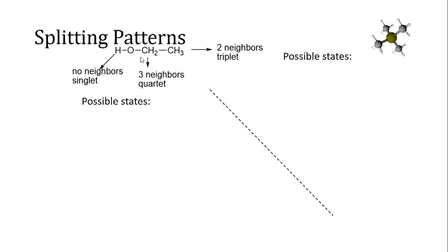Generally, in trying to figure out which hydrogen atoms are neighbors, we are looking at hydrogen atoms on the next carbon atom over. The neighboring thing and splitting tends to get interrupted by heteroatoms, oxygens, nitrogens, and so on. And so even though this hydrogen atom is attached to an oxygen, which is attached to the carbon, which has these hydrogen atoms on it, the neighbor thing doesn't tend to happen across oxygen atoms or nitrogen atoms. And so OHs and NH2s and NHs don't often get split. Another reason you don't see splitting there is because of the hydrogen bonding broadening the peak out.